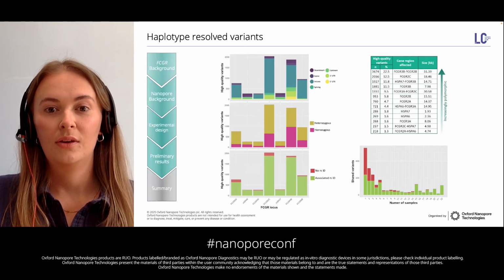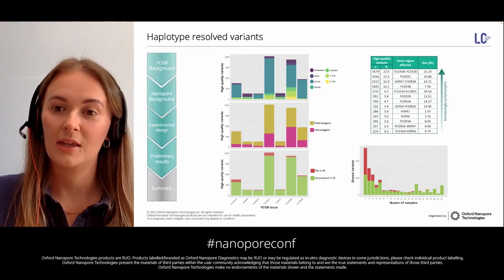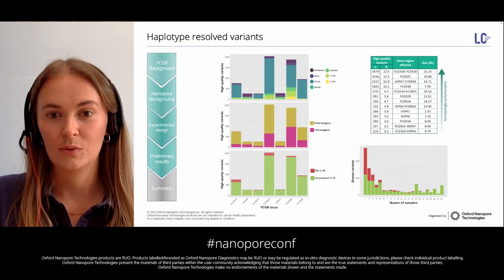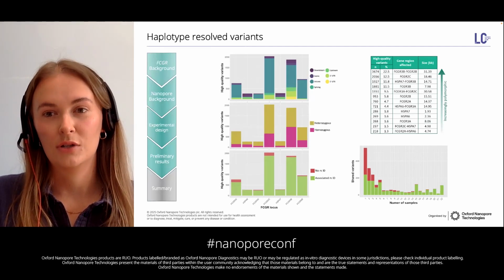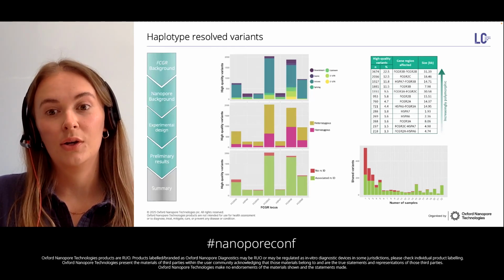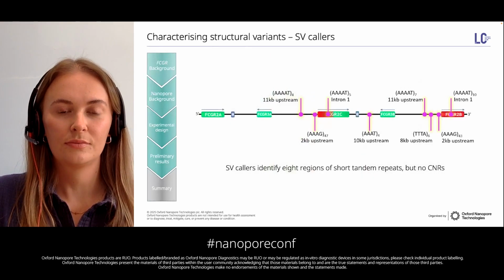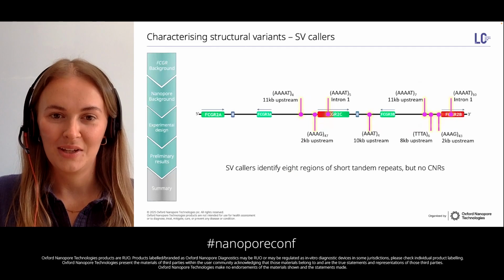This not only reveals regions that might have been misassembled within HG38, but also highlights consistent differences across individuals, giving us a more accurate and complete picture of the true genomic landscape, including variants within intergenic, non-coding regulatory elements that have long been overlooked. Then on to structural variants, which is a bit more complicated.